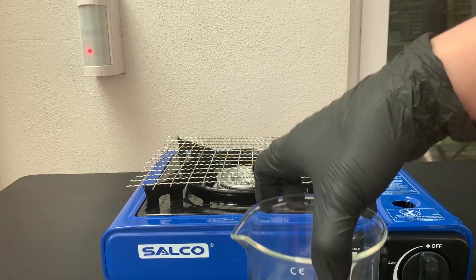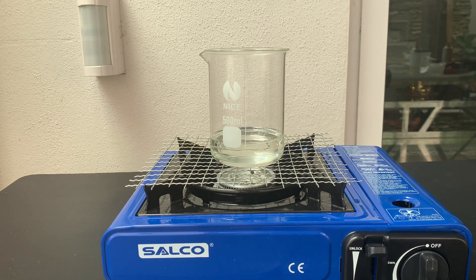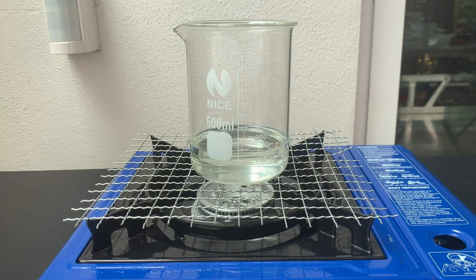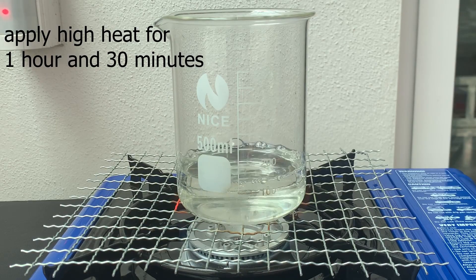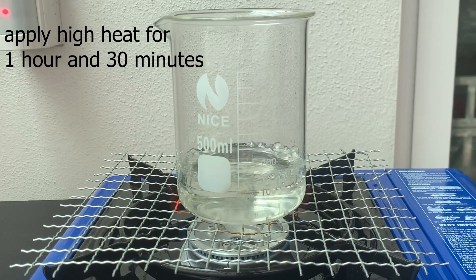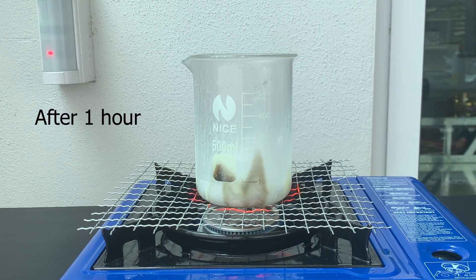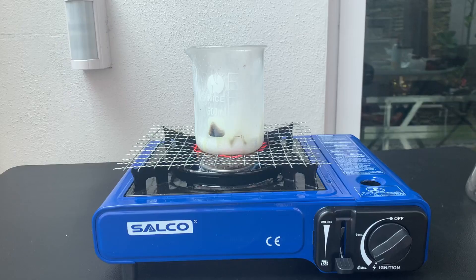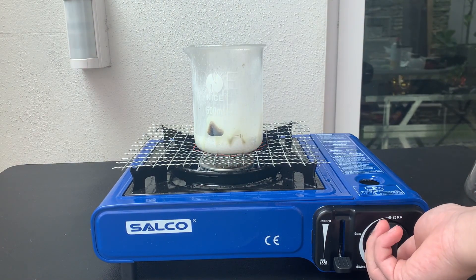The 500 mL beaker was then placed on a propane stove. I then turned on the stove at the highest setting. After a while of heating, the phosphoric acid starts to boil. We'll have to heat the phosphoric acid for 1 hour and 30 minutes. After about an hour of heating, the beaker was noticeably etched by the phosphoric acid. After 1 hour and 30 minutes of heating, I turned off the propane stove.